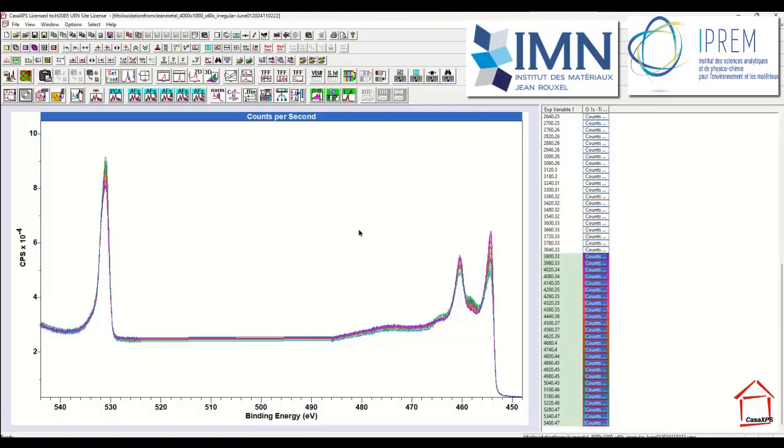These data are now all arranged in a column, overlaid according to the colours we see here. We're only interested in looking at the difference between two spectra, but when we organize the data in this format, the difference option will take the first and the last in the sequence, so that I can now construct another VAMAS file that will illustrate visually what these different spectra look like, and allow me to inspect and then determine which ones I prefer as potential component spectra for understanding the changes that we see within these spectra here.